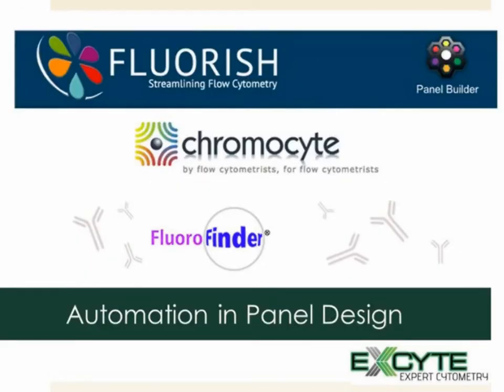Whenever I've worked with people in the past designing panels, after going through this exercise of identifying what antigens are available, it used to be send them out with a worksheet to pull out what antibody fluorochrome combinations there are out there in the commercial market. And that could take several days or weeks, depending on how complicated their panel was. There are several tools out there now that help improve automation and panel design.